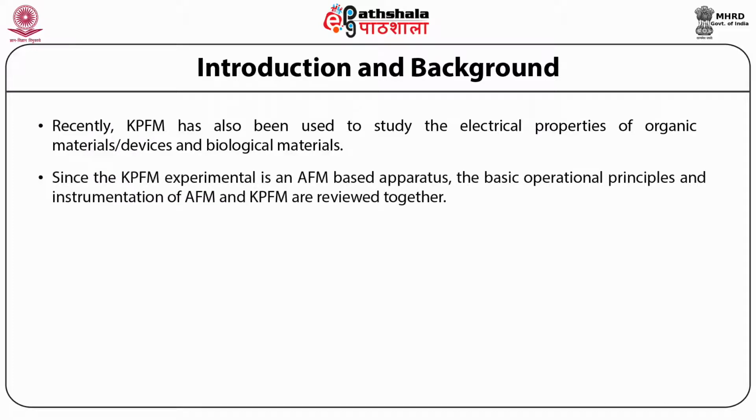Since this KPFM experimental technique is an AFM based apparatus, the basic operational principles and instrumentation of AFM and KPFM are reviewed together. A comparison is made between KPFM and other surface potential or work function measurement tools.